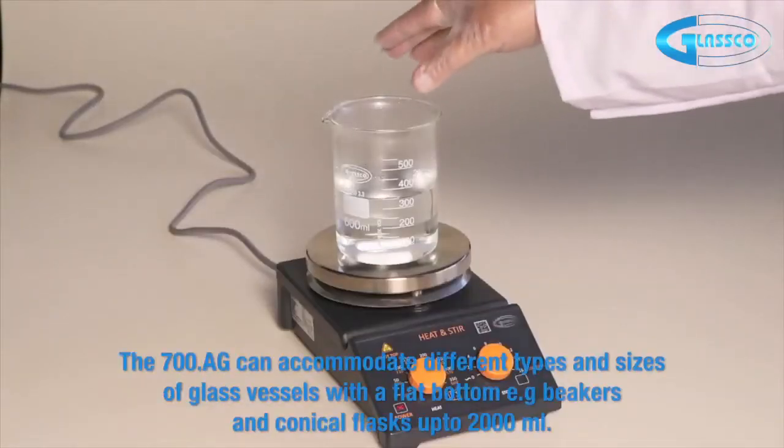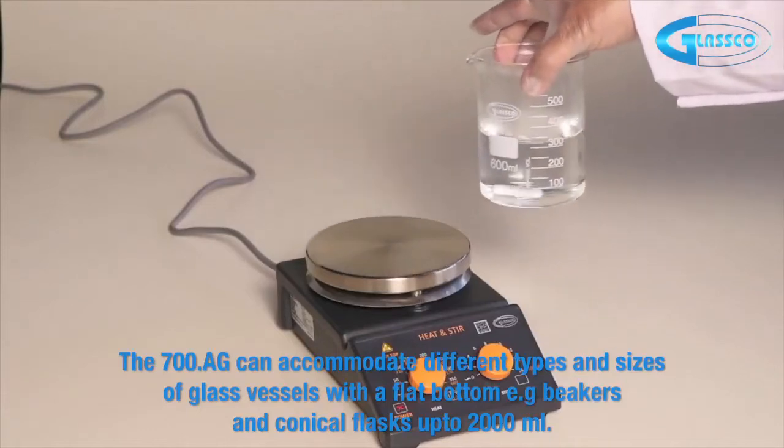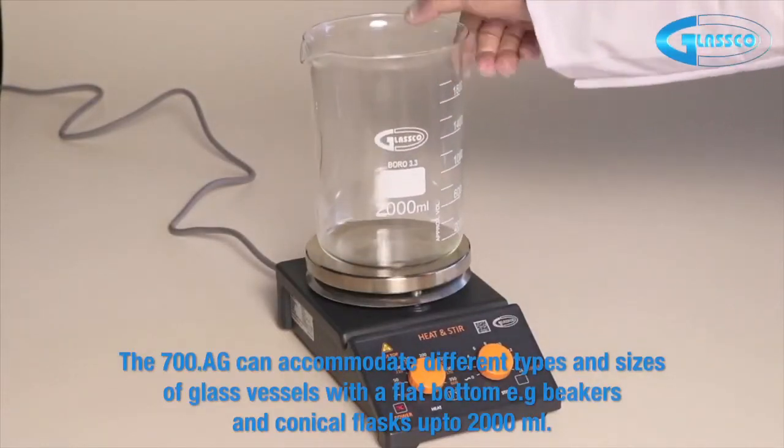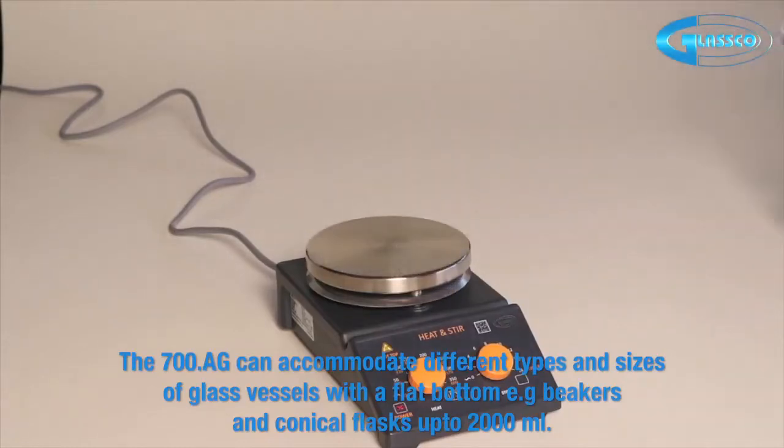The 700 AG can accommodate different types and sizes of glass vessels with a flat bottom, including beakers and conical flasks of up to 2000 milliliters.